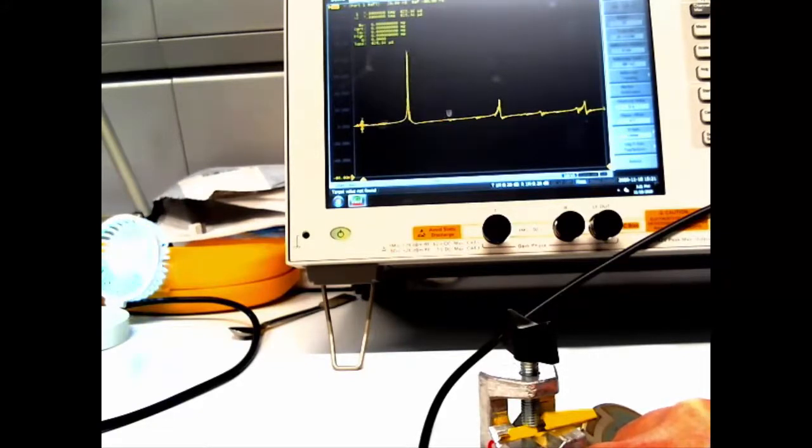You can see that there are 3 peaks because there are multiples of frequency that fit inside my crystal, so that I get sort of the main resonance band, and then 3 times it and 5 times it. So you get resonances at reasonably equal distances from each other in frequency.